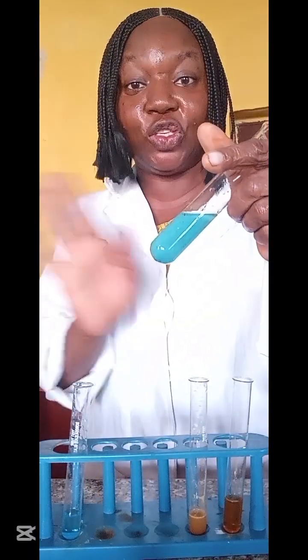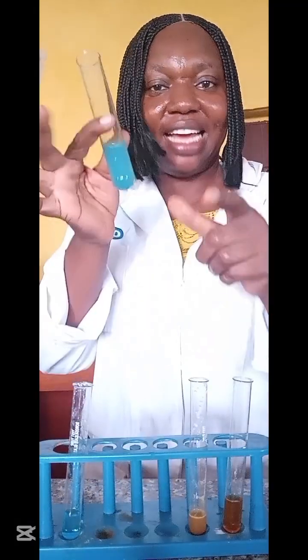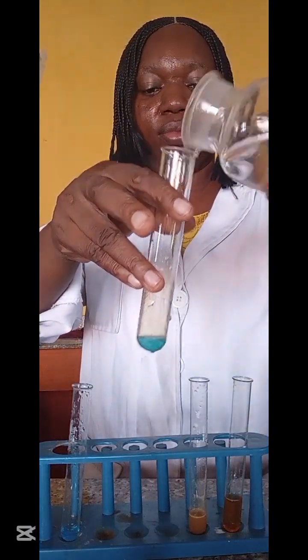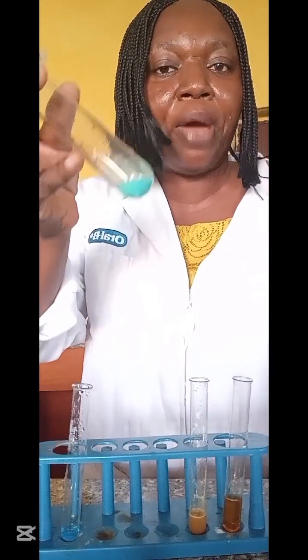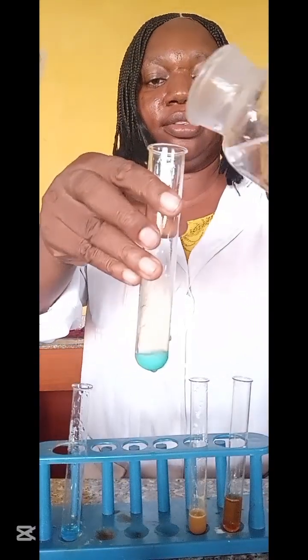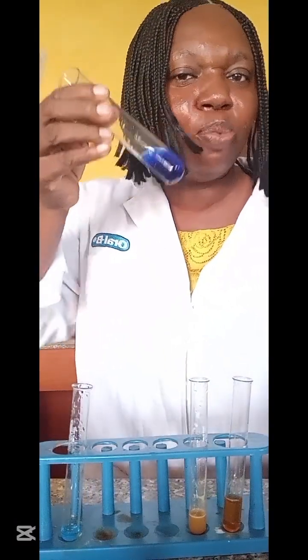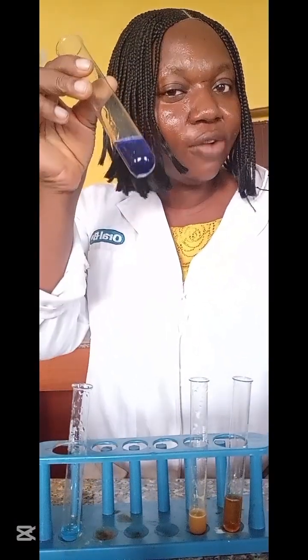Precipitate does not dissolve. That's copper 2 ion. Let's try it with ammonia. So still pale blue gelatinous precipitate. Then in excess, it dissolves to give a deep blue solution.